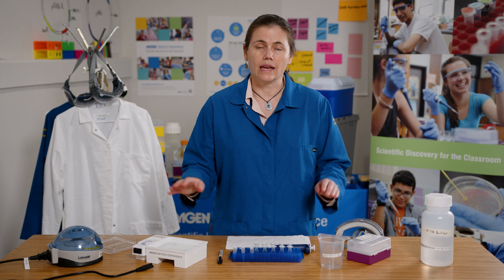Here are the reagents and the equipment that we'll be using in laboratory 4. This will be done almost exactly the same as laboratory 1.2, except that we'll be using samples that contain DNA instead of just dyes.